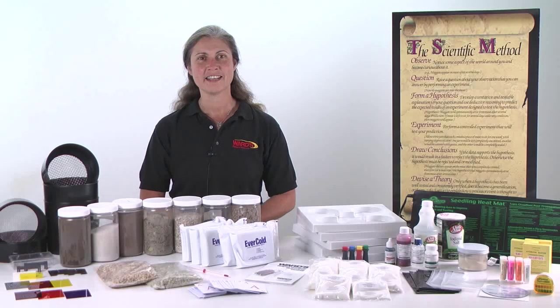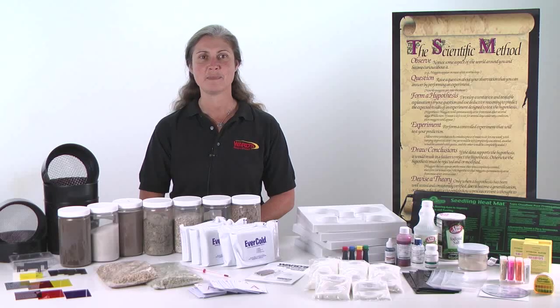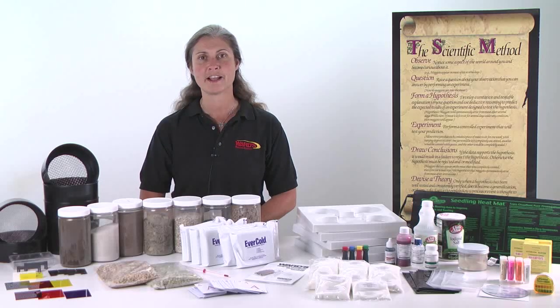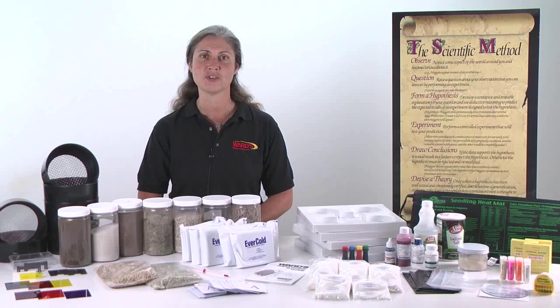Hi, I'm Jana, and in the next few minutes I'll be taking the time to show you Ward's new AP Biology Inquiry Toolbox. The Inquiry Toolbox is a useful accessory to any AP Biology teacher, whether you are using the classic style AP Biology labs and updating them to include an inquiry component, or using our new series of AP Biology investigations that already incorporates the inquiry component. The Toolbox is designed to help your students conduct open inquiry investigations.